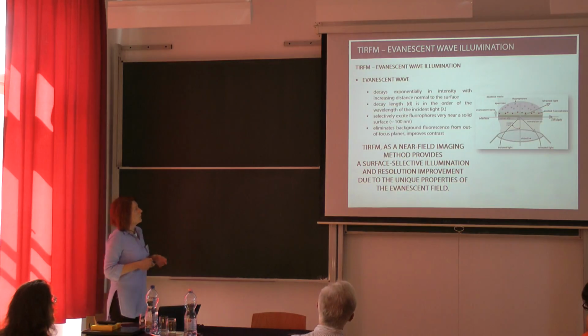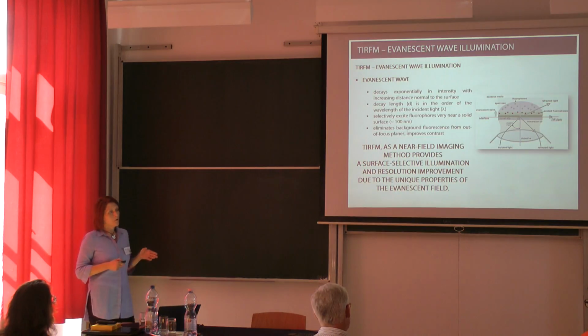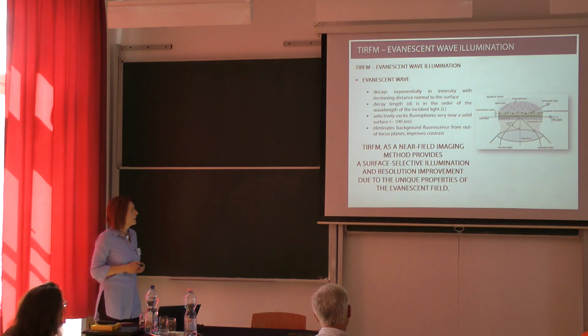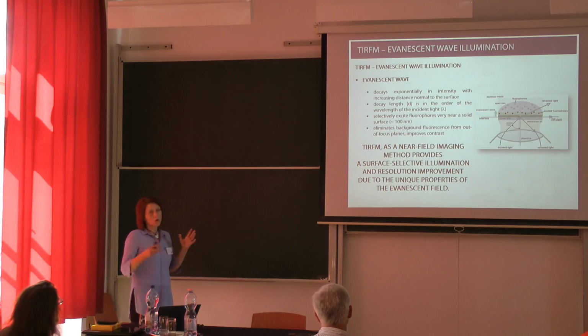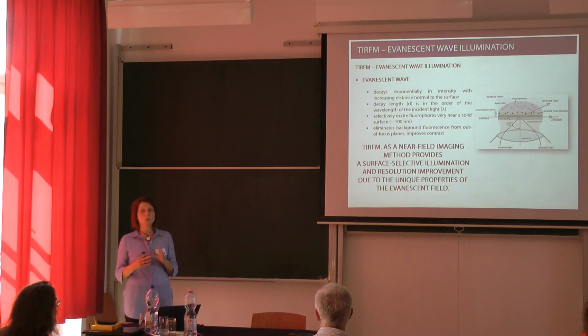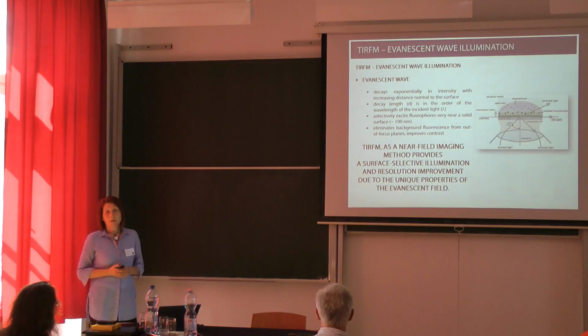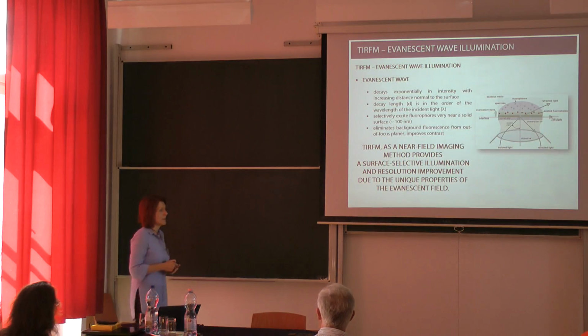Okay? So TIRF is a near-field imaging method that can provide better resolution than can be achieved by the classical fluorescence microscope, in the range of a few hundreds of nanometers, so 100 to 200 nanometer resolution, based on the unique features of the evanescent field.